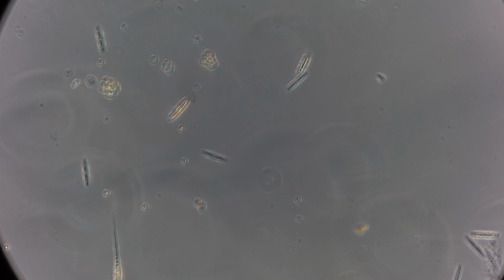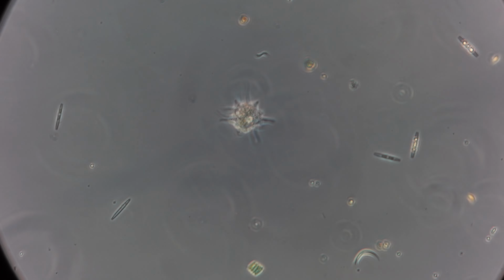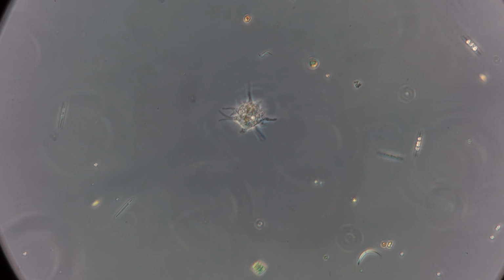Little flagellate. Oh my God, so many amoebas. I didn't even concentrate this, but I don't normally find this many amoebas. This is very odd. But this microscope also does something called differential interference contrast.